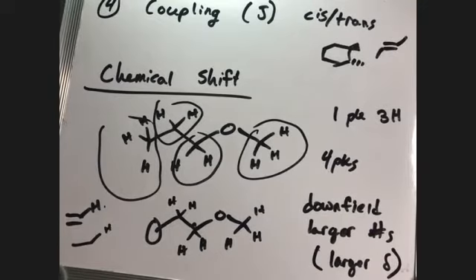So questions? I'm sure this is very confusing. NMR is always a very difficult thing to introduce, but bear with me as I go through some examples. I think it'll come together, but I'm going to try to build each step so that we can actually interpret NMR, because if you just jump into interpretation without going through this, it can be even more difficult to follow. And by the way, I meant to start with this figure, but I forgot about it.